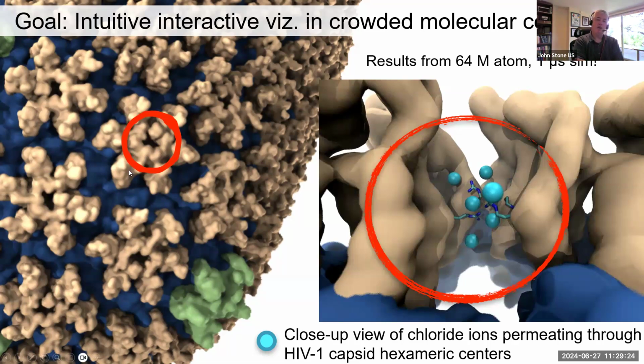We want to be able to see all these features. You can see how the surface is curved as it goes around. If we had to adjust the position of things like lights manually, this would be a really painful task in any software. And so that's one of the benefits of using things like ambient occlusion lighting on your behalf. As a scientist, you can just turn it on, rotate the structure, and in whatever position it takes, you'll be able to see those features automatically.